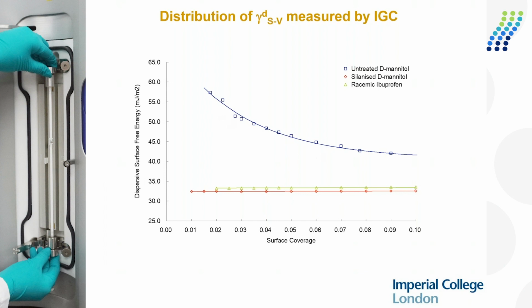So I can't say we've done it and it worked. We were fortunate we chose a material that was very crystalline, so it was quite forgiving. But there's nothing in principle why you could not use this technique with either amorphous materials or co-crystal materials. I mean, the wetting behavior is the same. Whether you're wetting an amorphous material or it's a co-crystal or a single crystal, the wetting behavior, the physics, is the same.